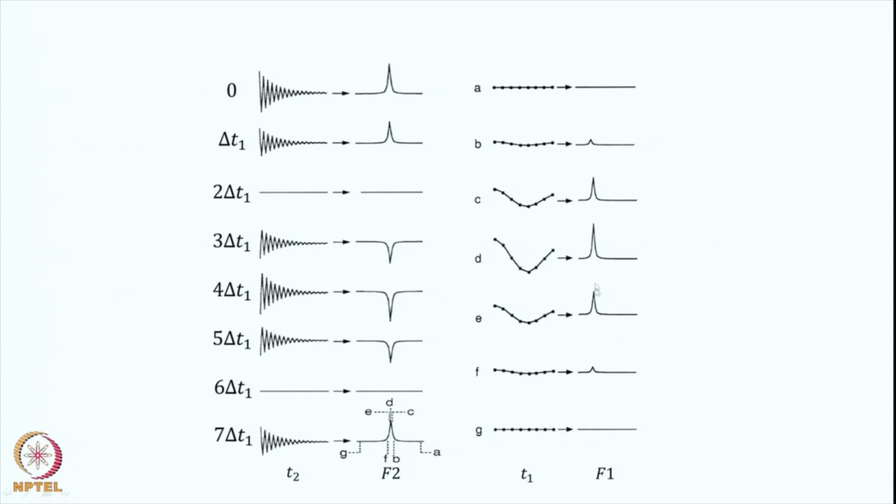So, this one now is called the F1 axis. So, I got an F1 frequency axis and I have an F2 frequency axis, these two things are different. So, I have generated two frequency axes by doing this sort of manipulation. Okay. So, this is very important, this point must be very clear before we go forward. So, I will try to repeat it here so that things become absolutely clear.